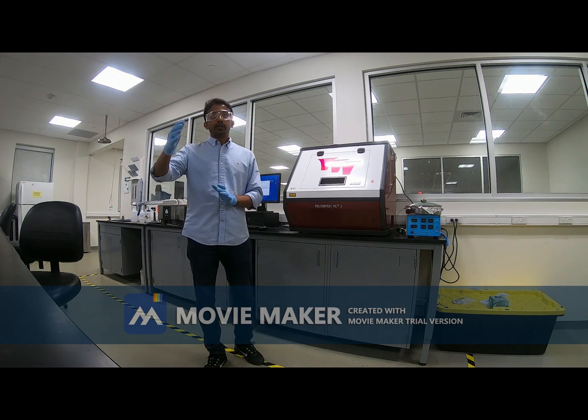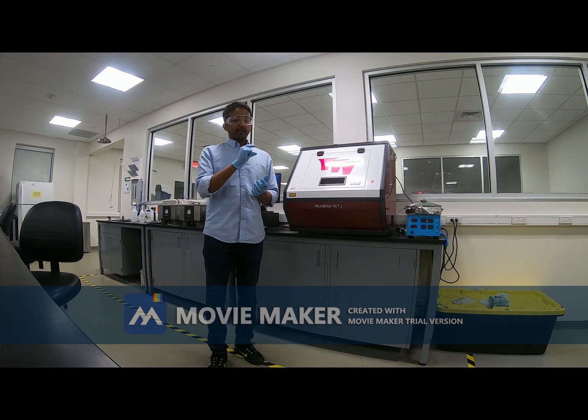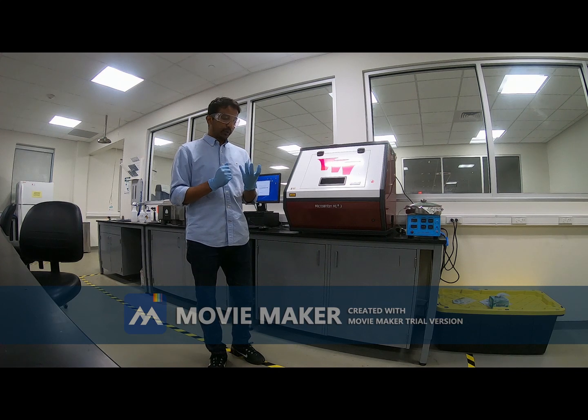After that, we will do the development with developer. SU-8 has a particular developer that we need to use, and after the developer works, we will see that some of the photoresist is removed, and we will see our design there.